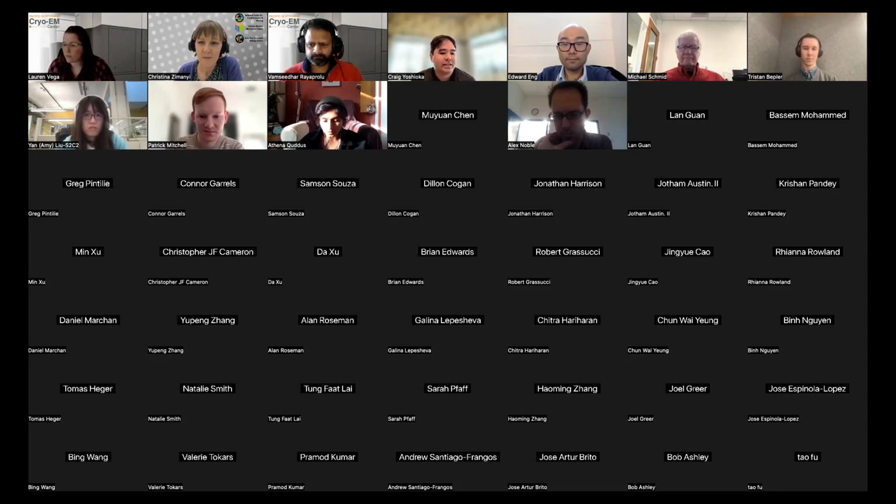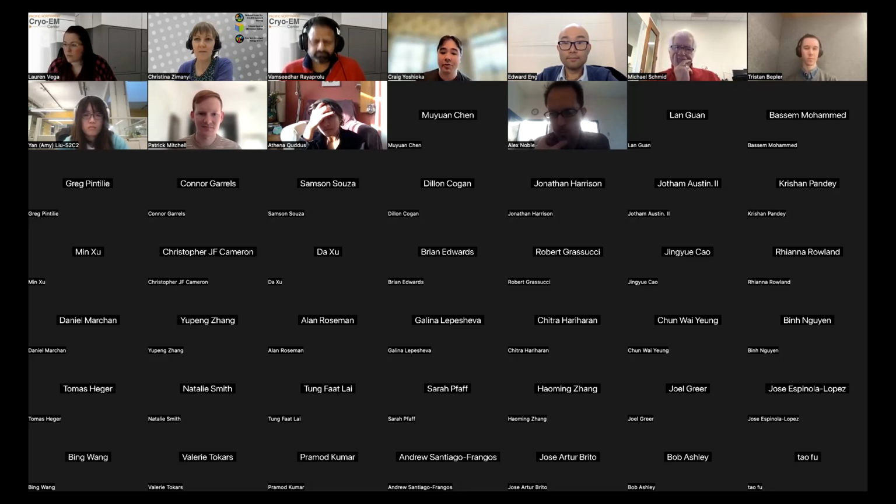Yeah, I don't know if it's a dissenting opinion. I'd like to add that, at least myself, I take a really pragmatic approach to most of processing, which includes particle picking. If something new comes out and it's cool, I'll download it and try it. But for most data sets, and I've looked at quite a few, you just crank the wheels. And you look at the output and see if there's a problem, and that's the real trick: trying to train people to recognize when there's a problem in their data set and correctly attribute that problem to, for example, particle picking.